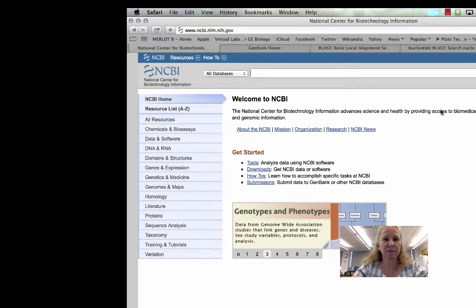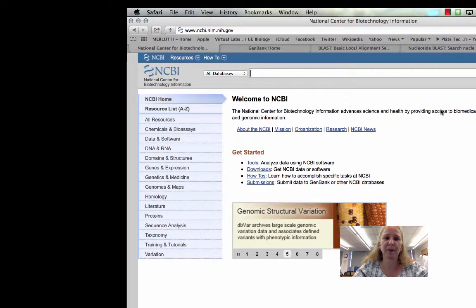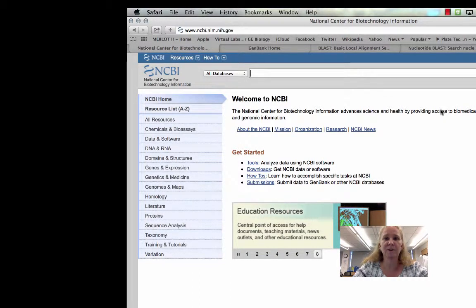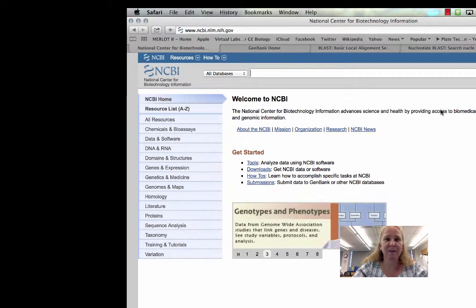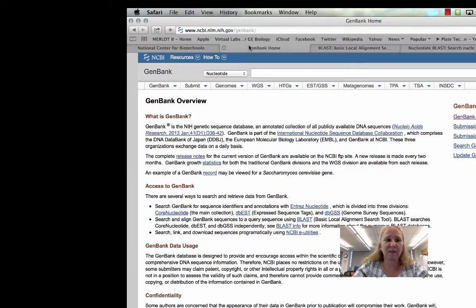Probably one of the most important databases for you to know about is this one, housed at the National Center for Biotechnology Information — NCBI. This is essentially the United States national database for biotechnology information. Any researcher who receives public funding in the United States, or receives U.S. money while working somewhere else, is required to submit all of their data to this database so that it's accessible to everybody in the public. NCBI's biggest resource is probably GenBank, which is the best-known. GenBank is the database where researchers post their nucleotide sequences for DNA that they have analyzed.